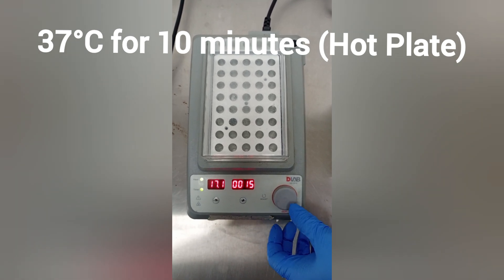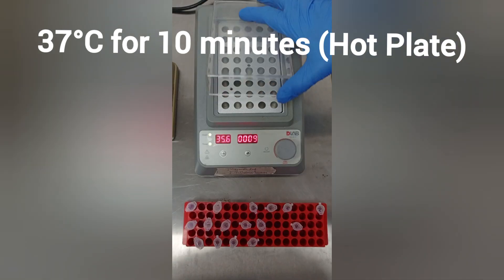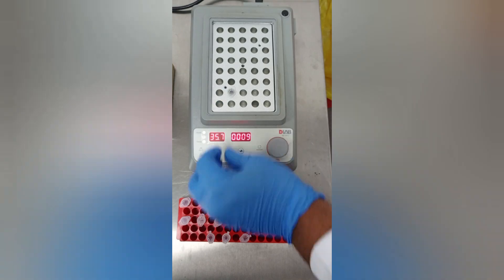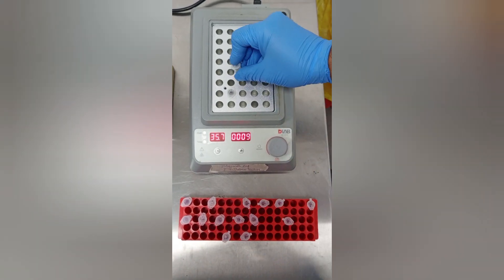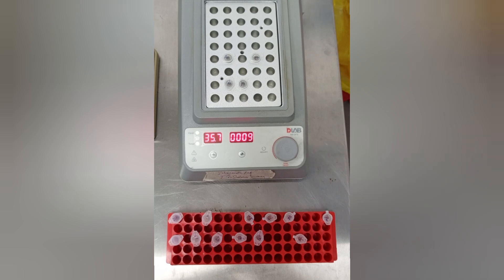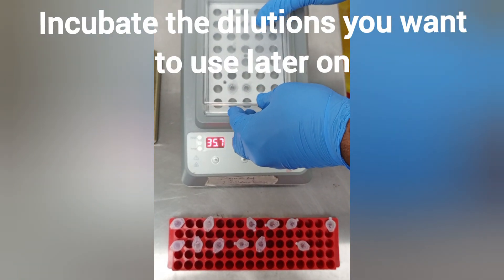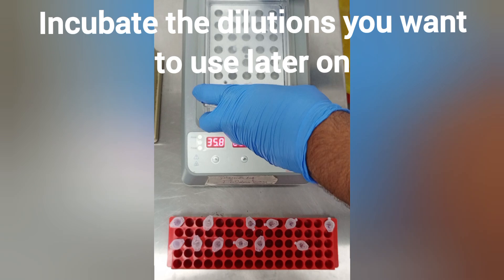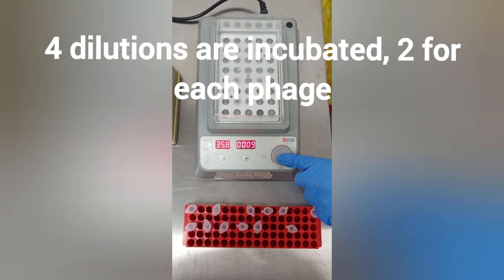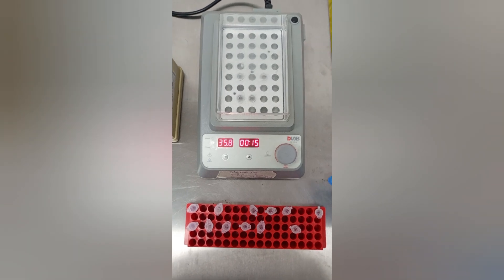Incubate these eppendorf tubes at 37°C for 10 minutes. For this step, we have used a hot plate; you can also use an incubator with the desired temperature. If you are optimizing your protocol and have no prior experience with the phages, you can use all the dilutions for further experiments and then choose the one with the best results. Here we have chosen 4 dilutions, 2 for each phage, according to our protocol.